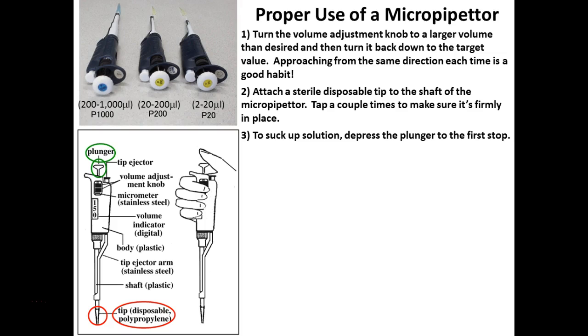And then when you're dispensing, you push past that stop so you can blow out all the liquid that's in the pipette. Now sometimes even that tiny little bit sticks on the outside, especially if you're dealing with really small volumes. So in the lab, when I was pipetting with these pipetters, I was pipetting into little tiny wells on a microtiter well plate, right?